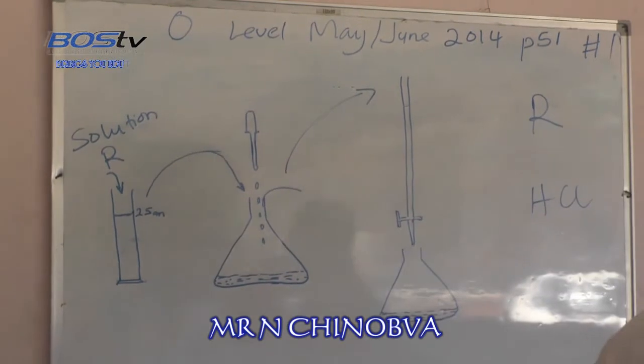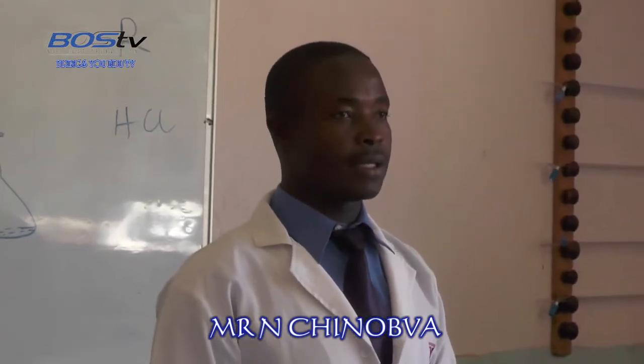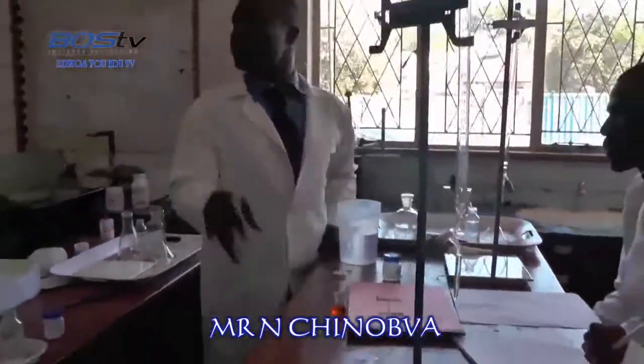Our first endpoint is going to be a color change from the pink color of phenolphthalein indicator to colorless. Then the other endpoint is going to be observed by a change from orange to around pink. So this is your setup.